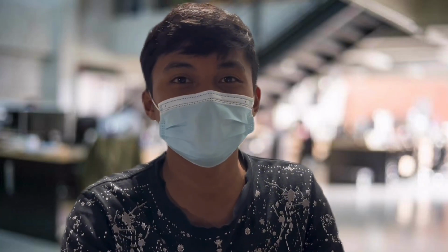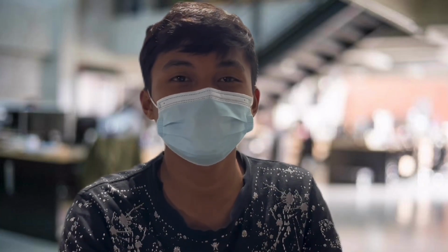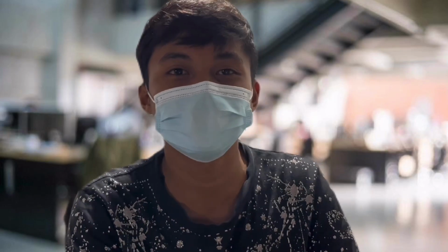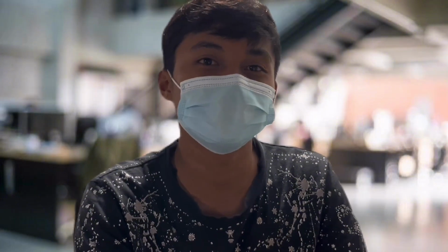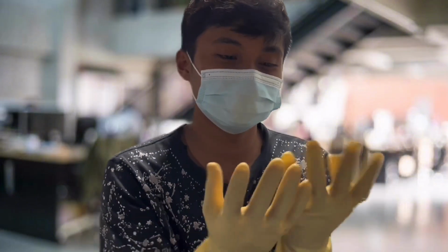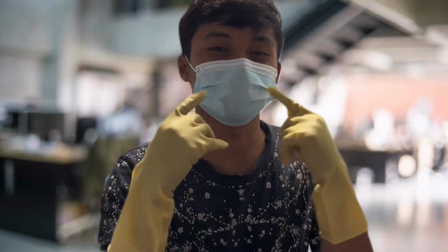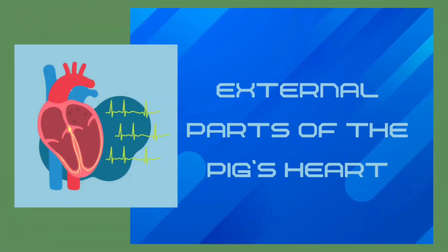Pulido and I'm here to dissect a pig's heart. So fun fact, we use a pig's heart in our experiment because a pig's heart is similar to a human's heart. So you see guys, I have safety gloves and a safety mask. So let's start.